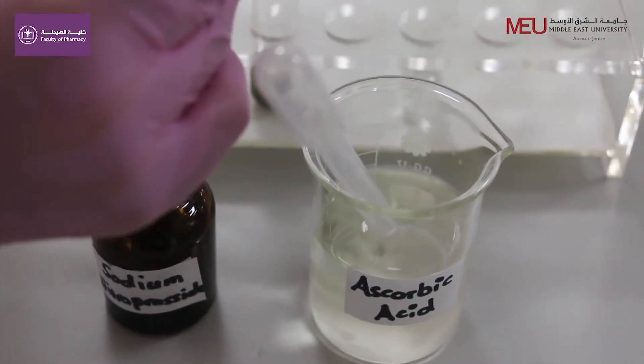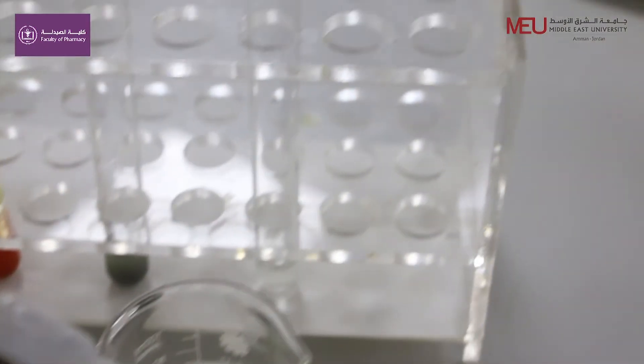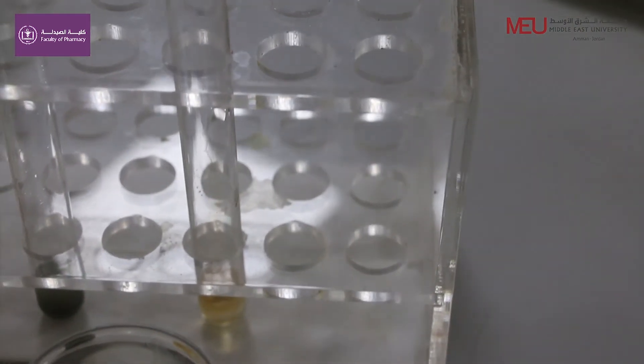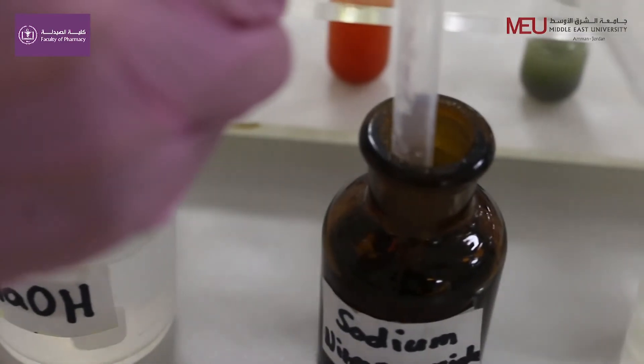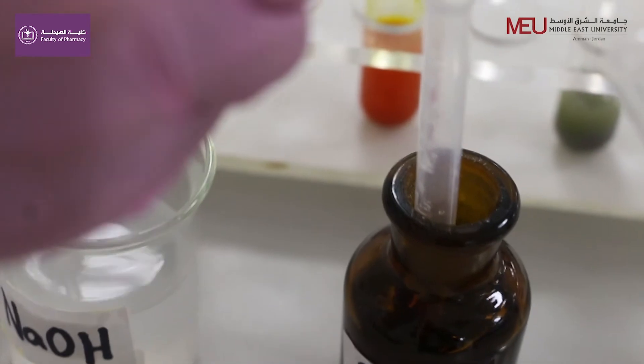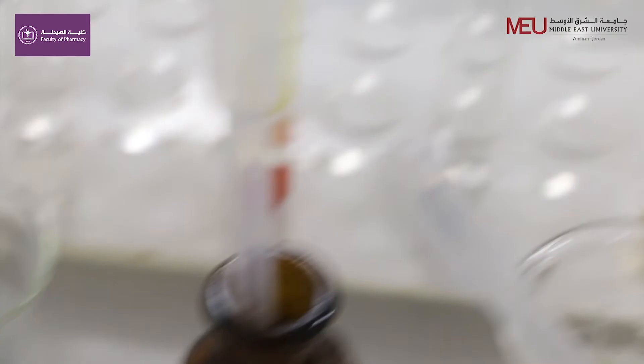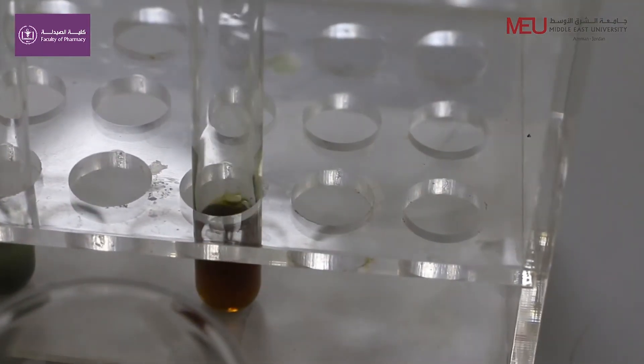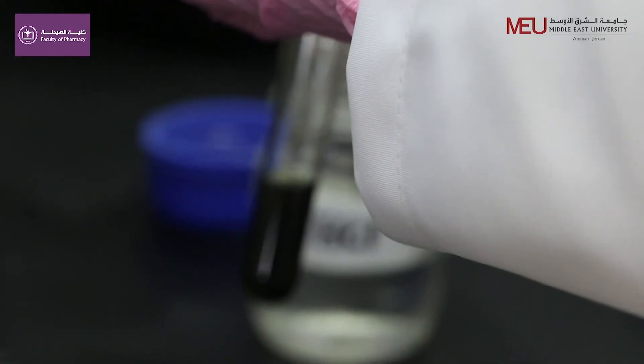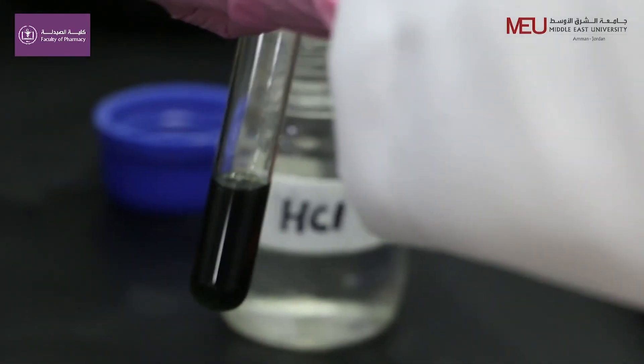Add 0.5 ml of sodium nitroprusside. Add 2 ml NaOH. Add 0.7 ml HCl. You will observe blue-black color.